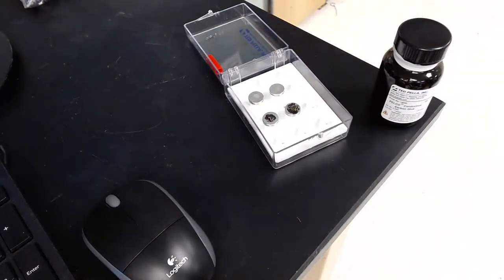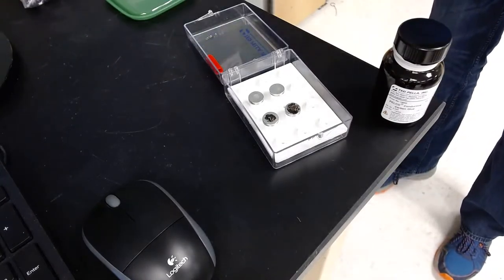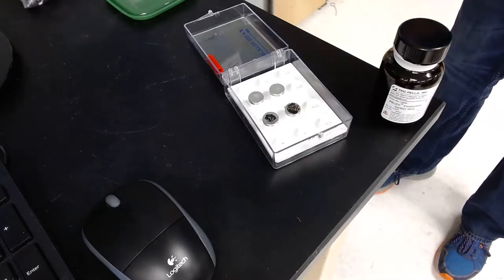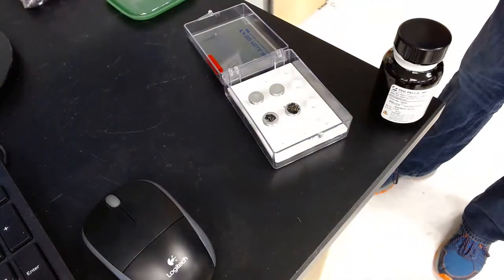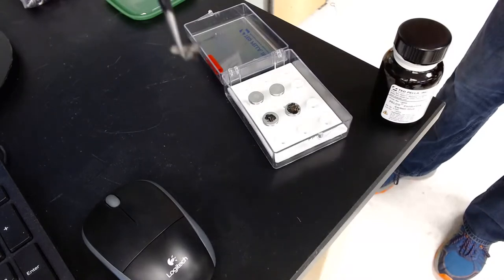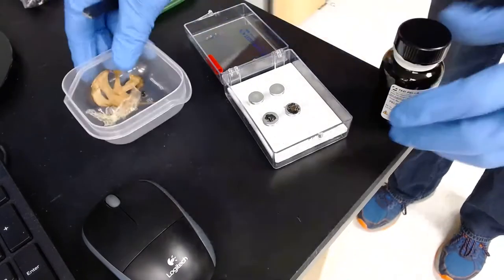The next wonderful sample we have was donated from the private collection of our own cosplay aficionado and leader. We have two samples. We have snake skin. Ooh. That we're going to look at. Snake skin. Everyone see that? Yeah. And we also have a precious little black fly. Yeah, see that? Yeah. Okay. They aren't going up.